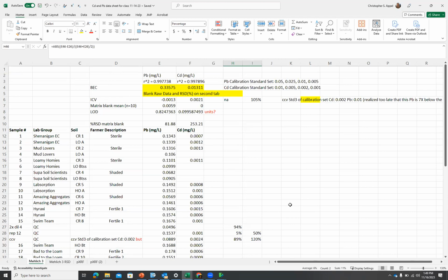Okay. So the plan is to have some QC tables that you'll have mostly organized, and also to have some actual data analysis of the cadmium and lead data. And we'll use our comparative tools in the graph builder, and make a histogram with a connecting letters report associated with it. So that's where we're going. Do you have any questions about that? Okay.